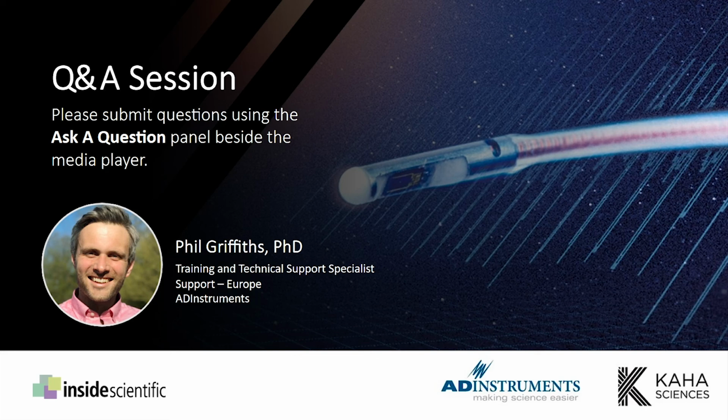So for EEG recording, you have to embed them in dental cement to hold them in place. So be quite sparing in using that dental cement so that you trim as little as possible. The leads are quite long as well, I think off the top of my head they're about 25 centimeters. So you should get a good few uses out of them, as long as you're careful as well, before having to buy a new one.